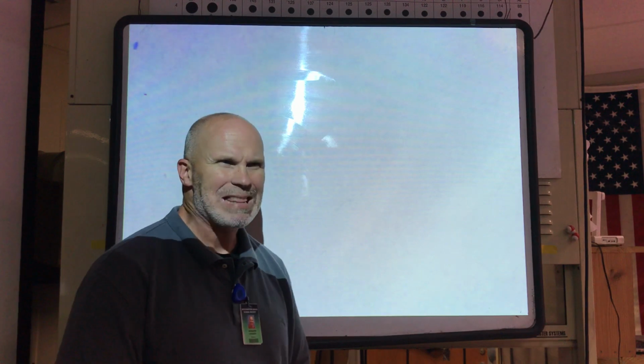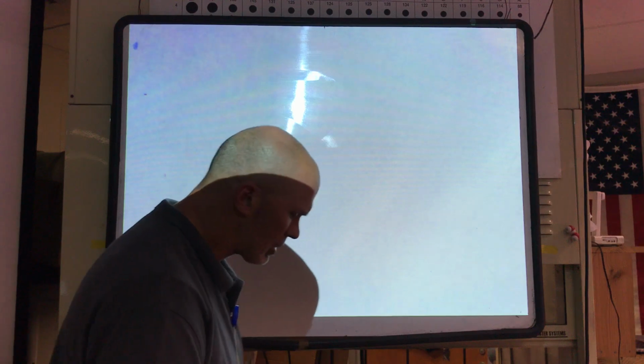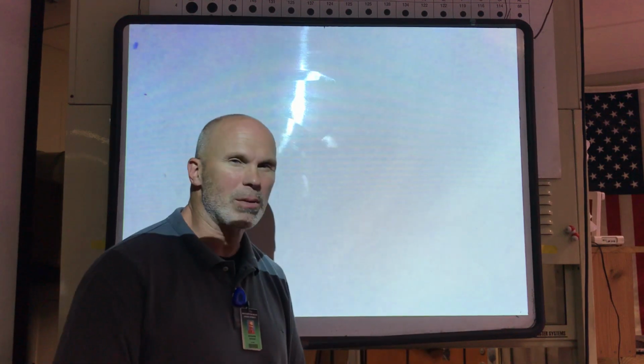So let's begin our review of the copper iodide lab. Specifically, the lab is about attaining the empirical formula of the product between copper and iodine. What I'm trying to do here is show you how to do the lab, how to grab the data, and importantly, how to calculate the empirical formula and how to predict the products in the reaction based on the empirical formula that you determine, and of course, how to do a percent yield. So again, the first objective was to get the empirical formula.